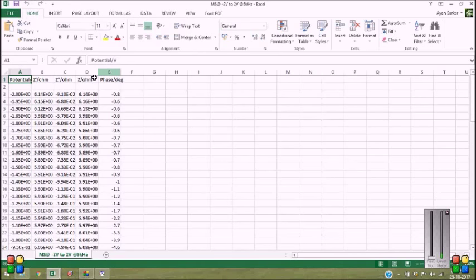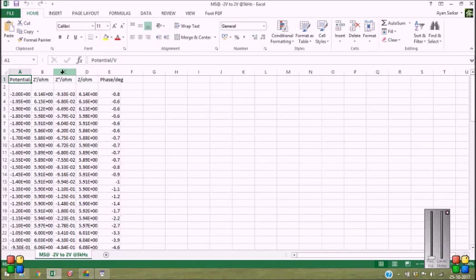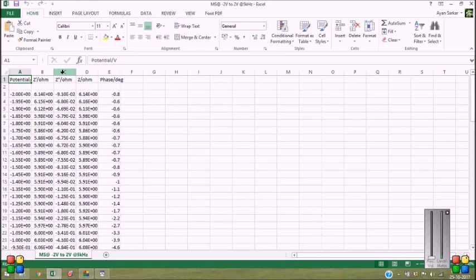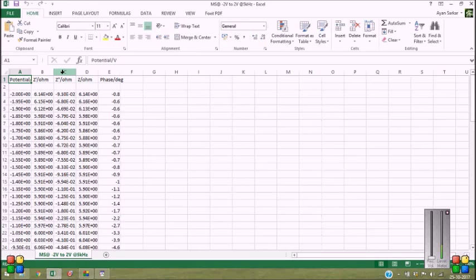So to get the Mott-Schottky plot, I need column A and column C. And I have to obtain one by Cs square value. So I can use one simple formula to get the one by Cs square from Z double dash. And the formula is one by Cs square equals minus omega Z" whole square, where omega is the angular frequency, which is 2π times the linear frequency, and Z" is the imaginary part of the impedance.